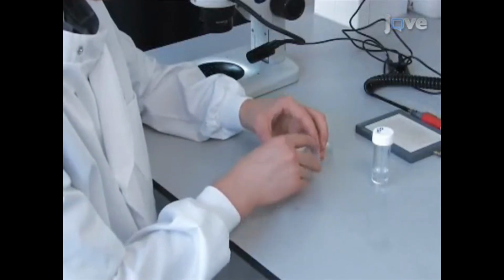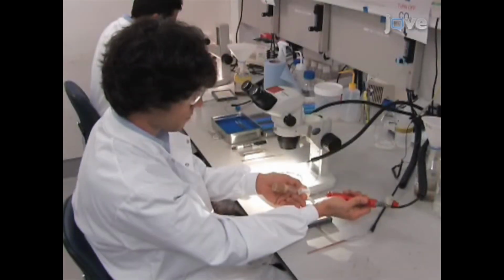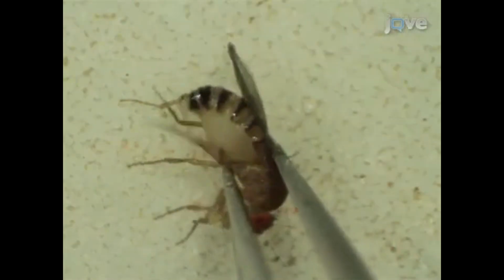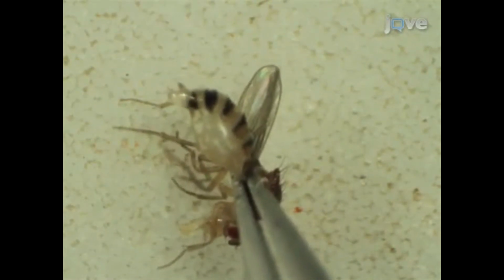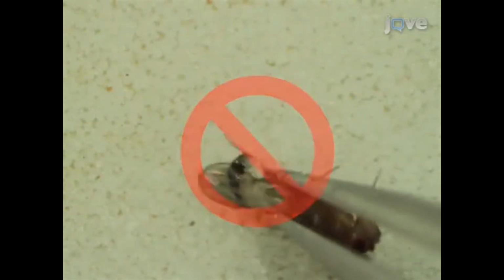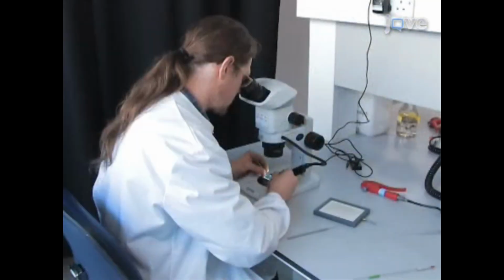Begin this procedure by placing a small drop of halocarbon oil on a cover slip and set it aside. Then, anesthetize the prepared flies with carbon dioxide. Use a sharp, fine-nosed forceps to grasp a fat female fly at the anterior of the abdomen. Do not grasp in the center of the abdomen. Hold the female roughly 2 to 3 centimeters above the prepared cover slip.